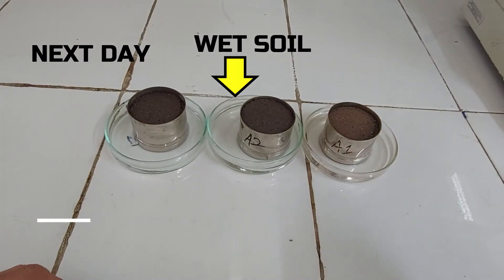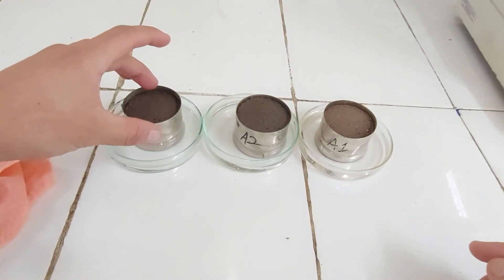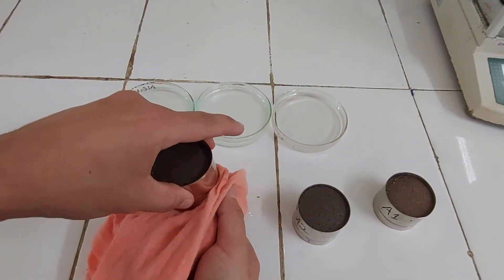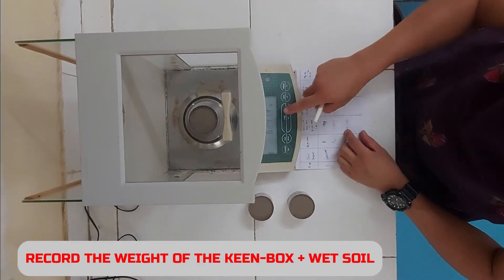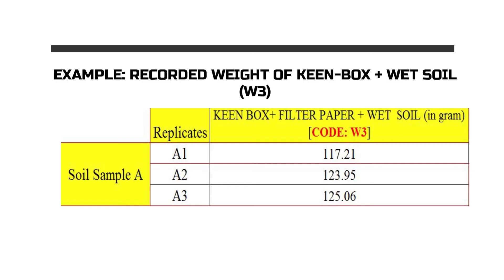The next day, check the soil sample in the Keen Box and you will find that the soil is wet. Remove the Keen Box from the petri dish, then wipe the Keen Box with a dry and clean cloth at least two to three times before weighing. Finally, record the weight of the wet soil inside the Keen Box and let this recorded weight be coded as W3.